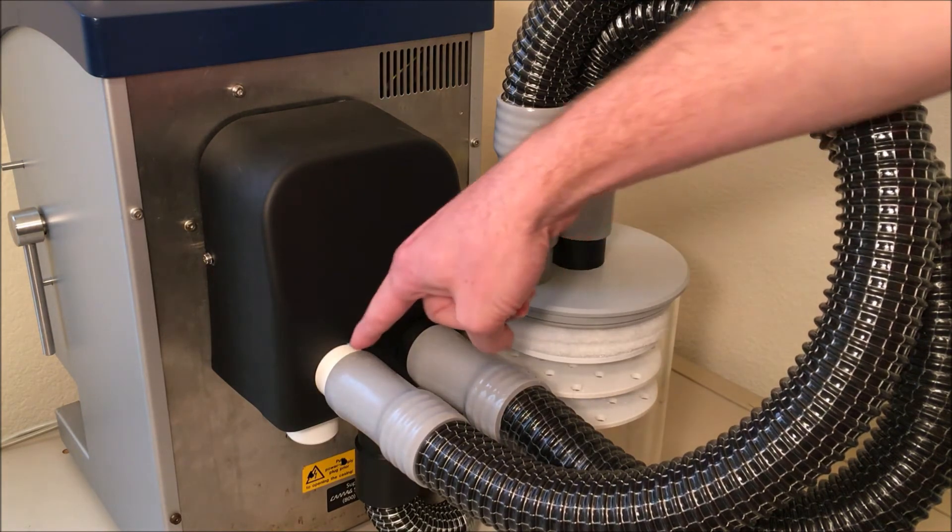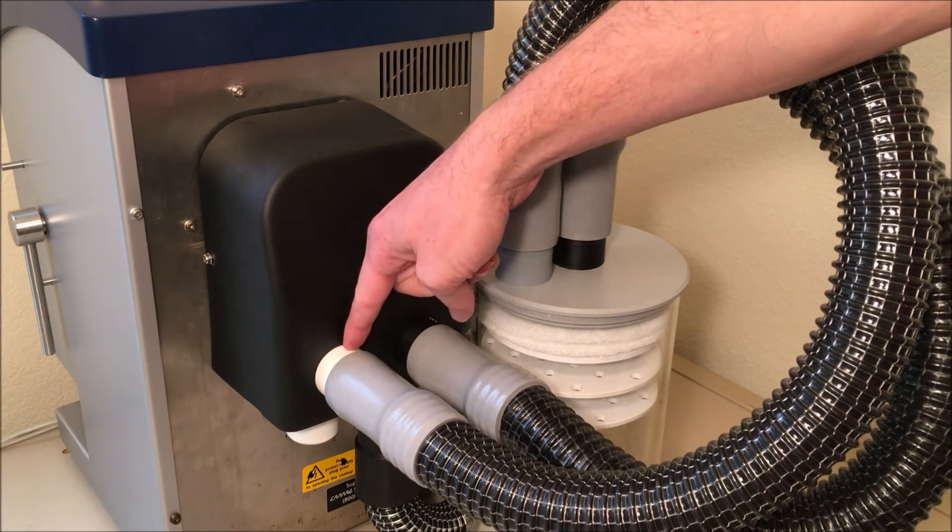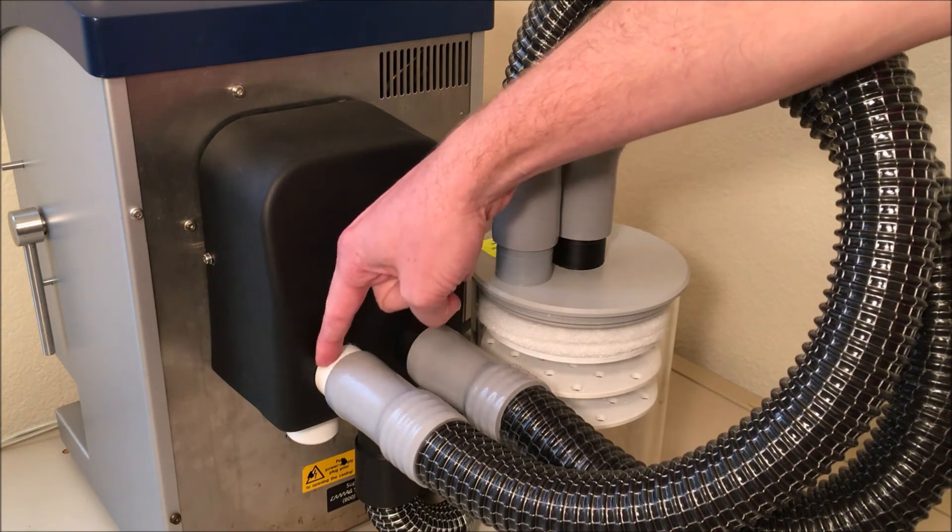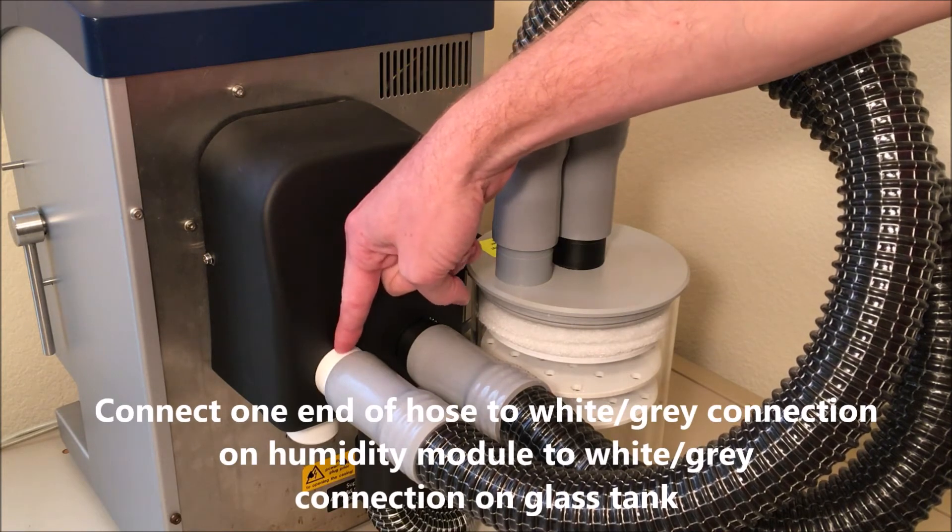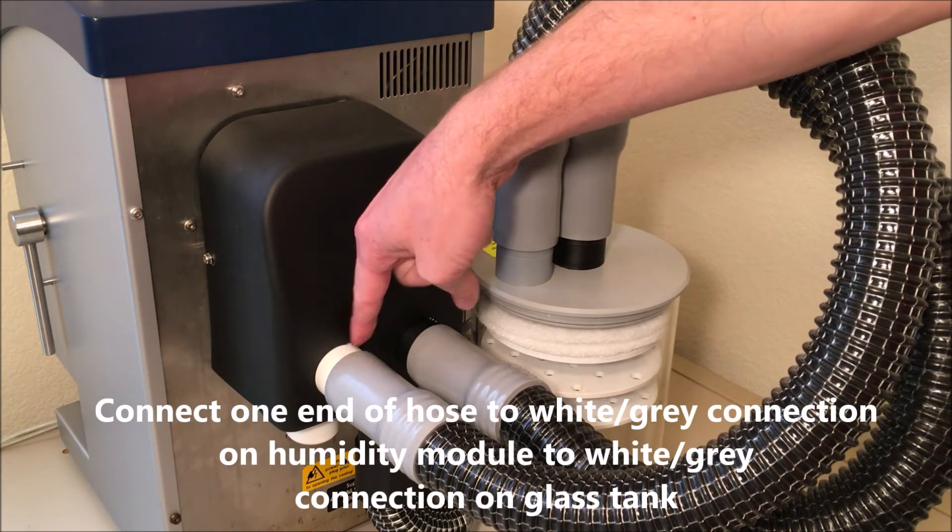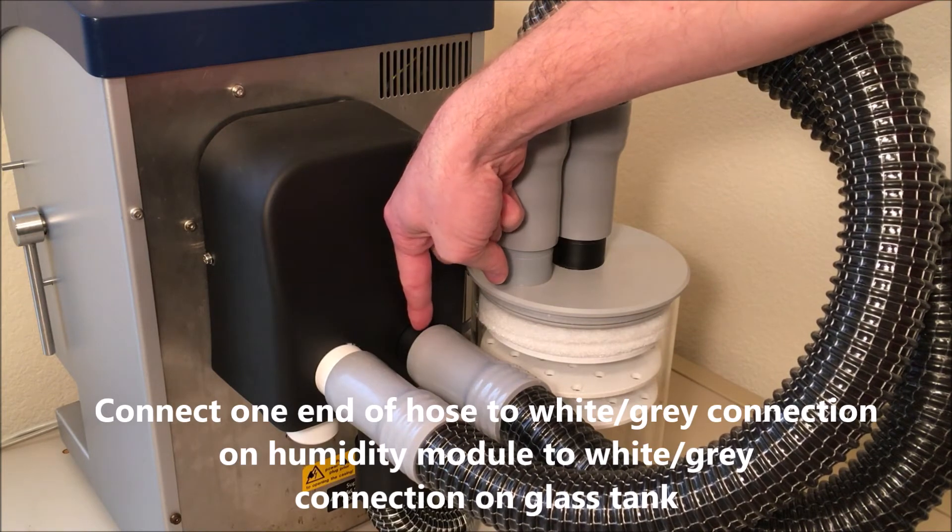So the first hose will connect to the left side here and you can see that it's actually color coded. So on this particular unit the left side is white, it may be grey on yours, and the right side is black.